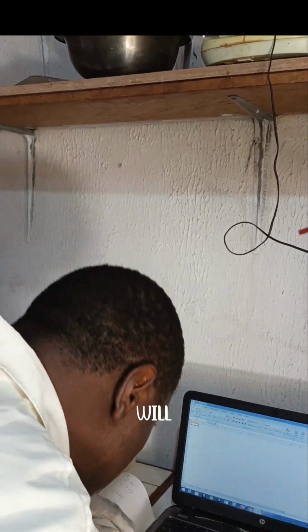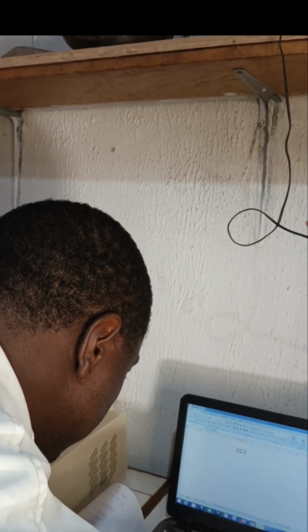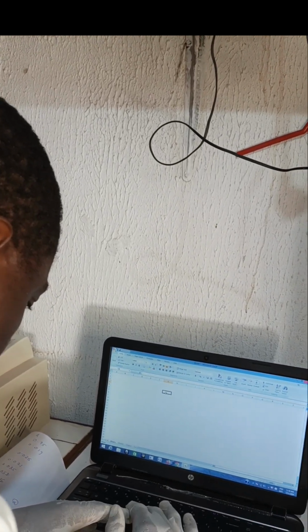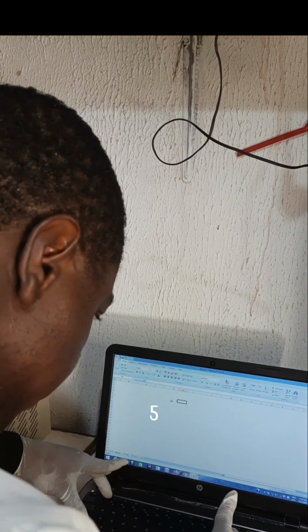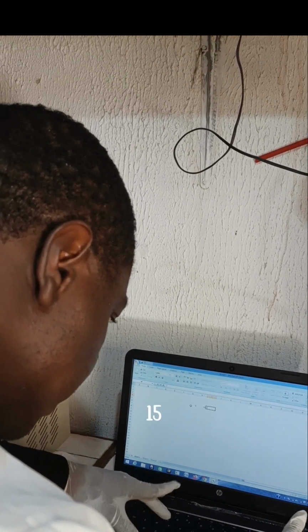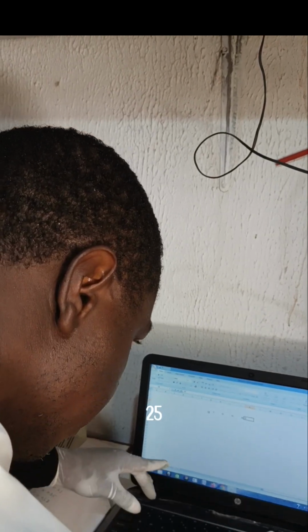From the plots, these are the concentrations: 5, 10, 15, 20, 25.